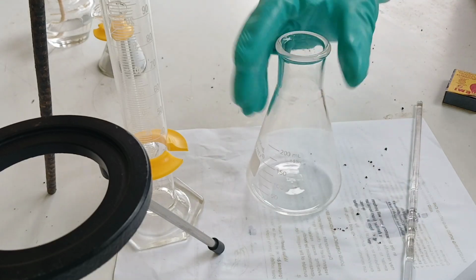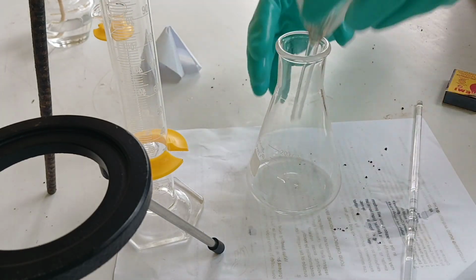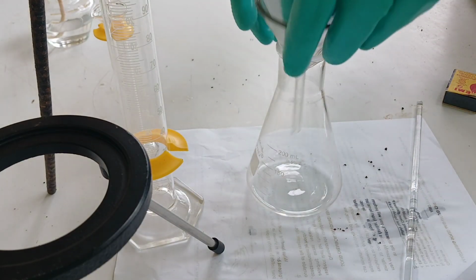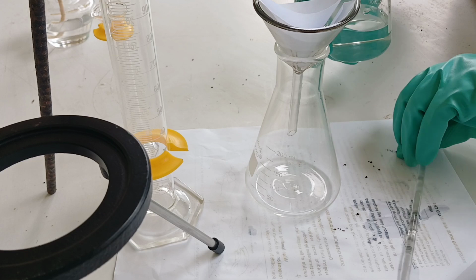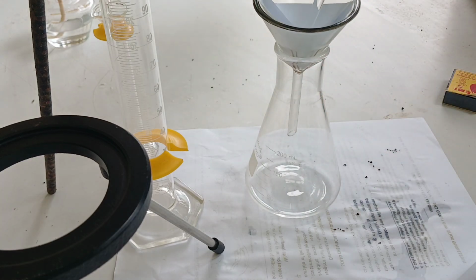By this time, that is an Erlenmeyer flask, using a funnel, and of course with the paper, and that is Whatman 42 filter paper. So what I'm trying to do here is to decant, to separate a mixture of solid and liquid, and I'm trying to eliminate the liquid. That's why I transferred it using that technique, to separate it from the solid.